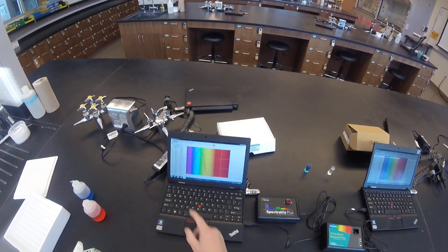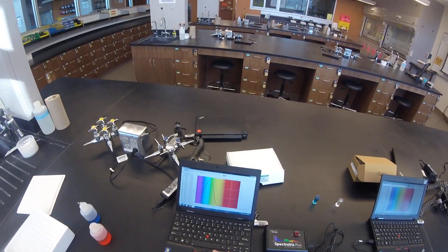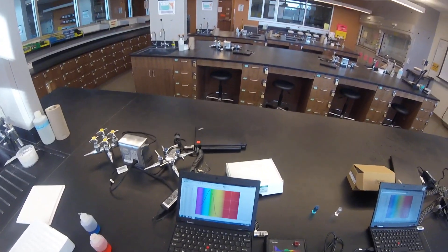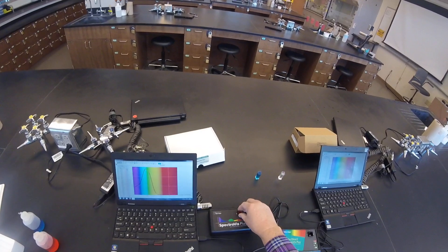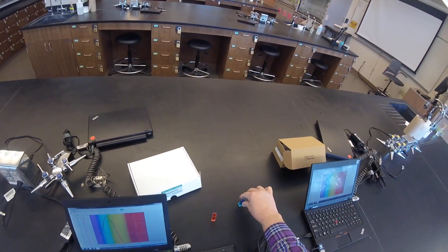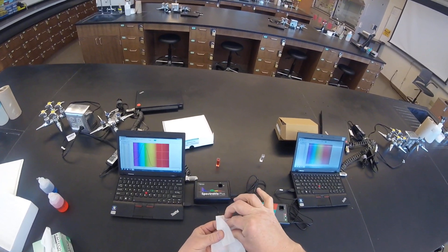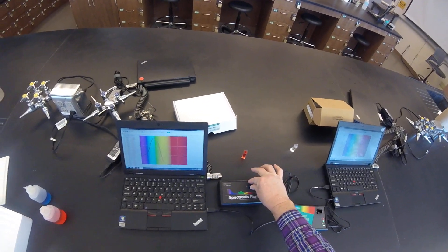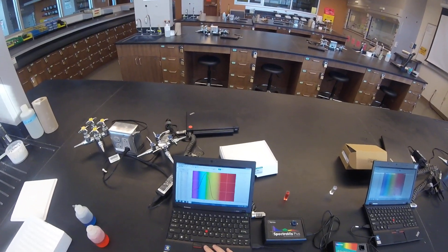And after a few seconds, you'll see a Spectra. You can go ahead and stop. Take out the red. I'm going to go ahead and put in the blue dye. And I can go ahead and click Collect.